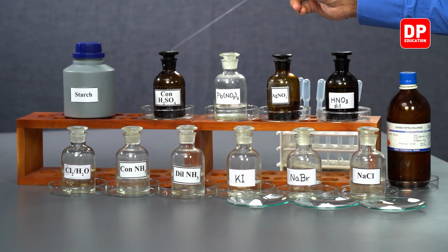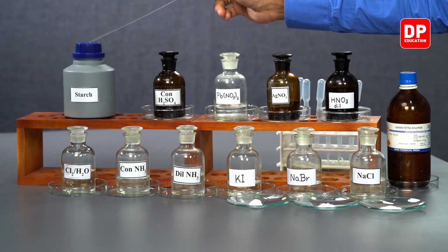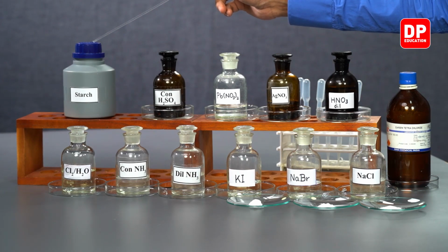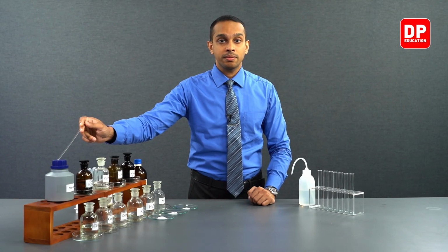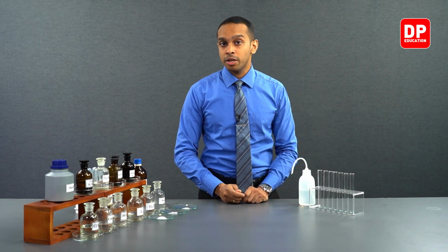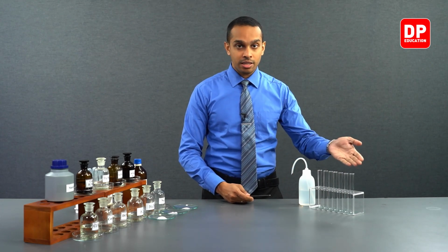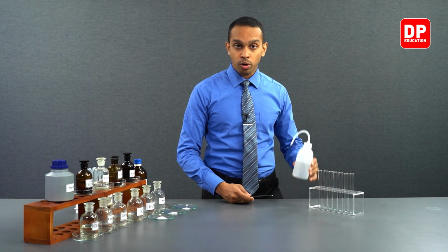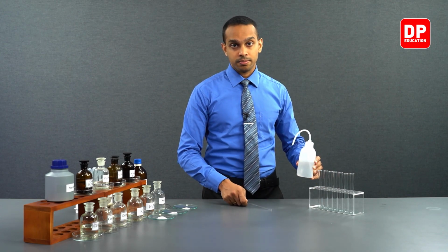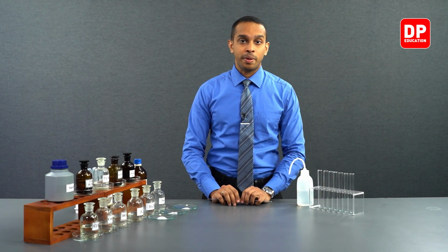We'll be using concentrated sulfuric acid as well as a little bit of starch. Using this starch, we'll be making a starch solution later in the practical. Apart from the reagents, we'll also be using some equipment such as test tubes and a wash bottle containing distilled water. Now, let's move on to the experiment.